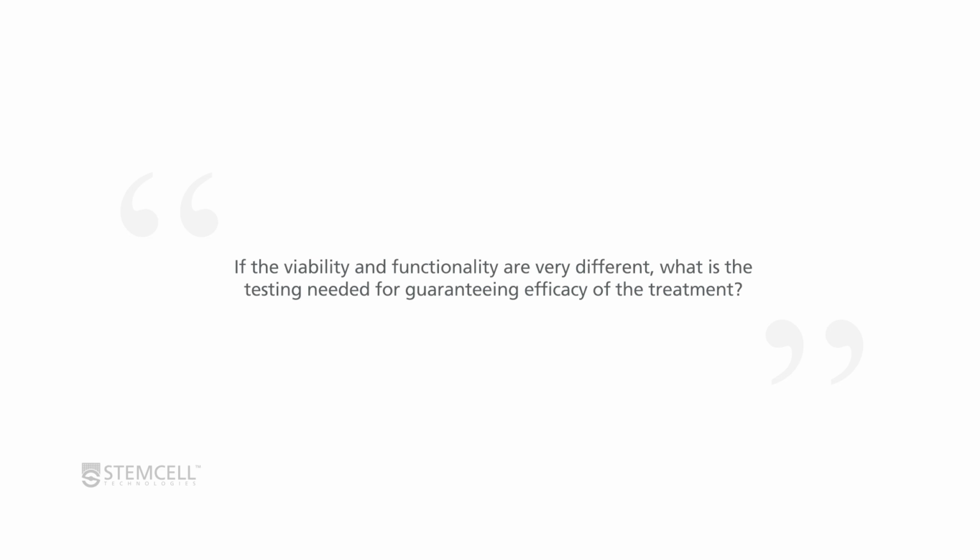So to me, it was easier to standardize the CFU, which is why I think a lot of research has focused on that. The reality of having another standardized assay, it would be great to have something that was shorter. Again, always having to compare it to the CFU, but hopefully one day you can actually see viability, but you have to show some kind of biological function. For T cells, for example, you're going to have to show some kind of effector function, that it actually affects the cells that you say it's going to affect, and not just say, oh, they're viable.